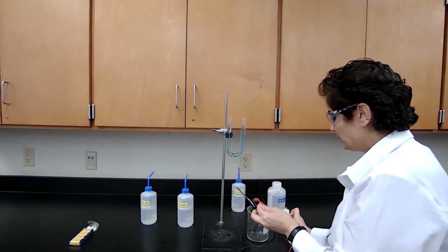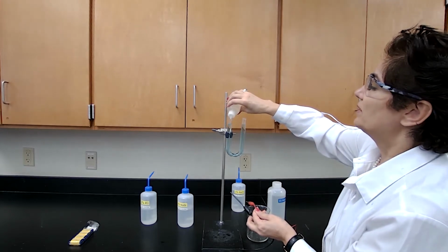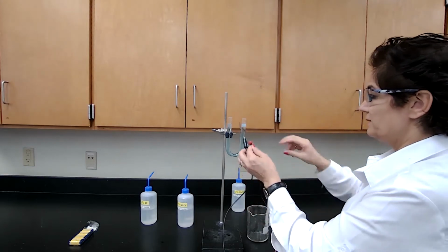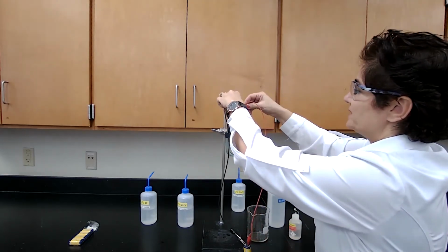Also, you want to add phenolphthalein to each arm side. You will add the phenolphthalein and wait for the reaction to take place.